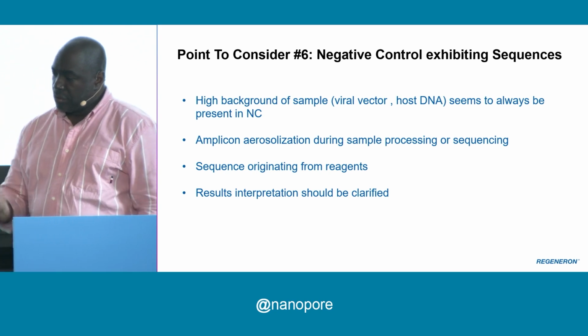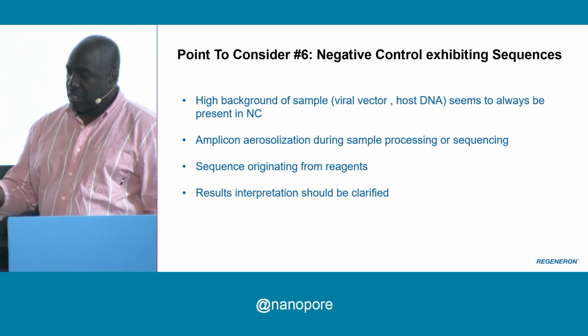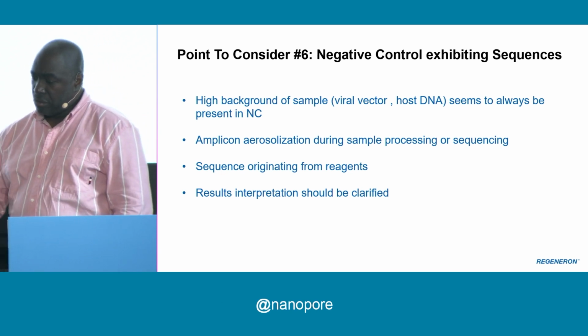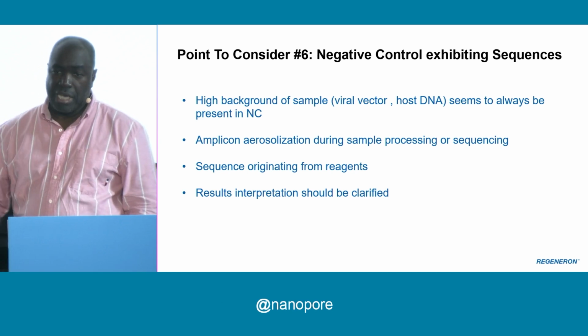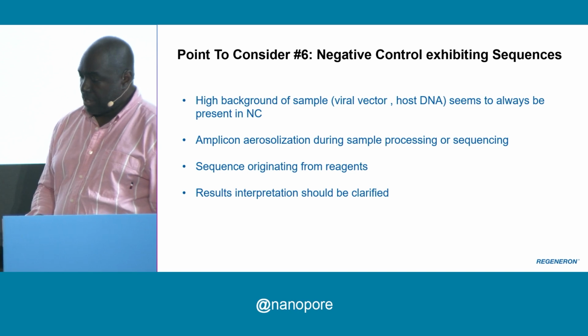The negative control exhibiting sequence is a big challenge here. Like I said, we are going through some experiments with lab setting, equipment setting, and reagent control to reduce that and make sure that we have a negative control that's truly negative at the end.